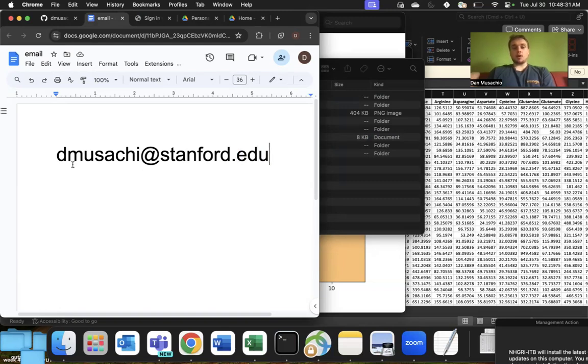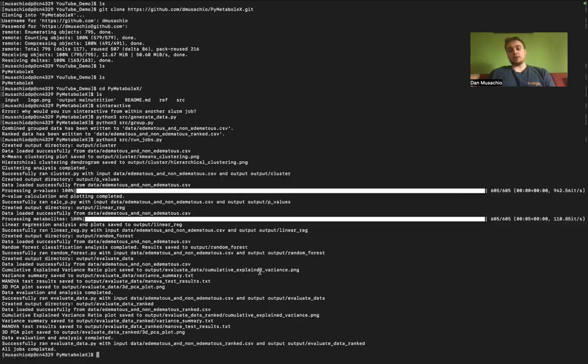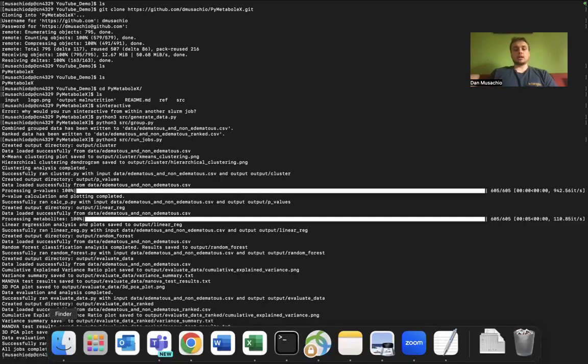I think overall this software gives a lot of helpful ways to visualize the data. It's pretty easy. As you can see, once you set up your source files, you just run 3 commands and it takes about a minute to generate.